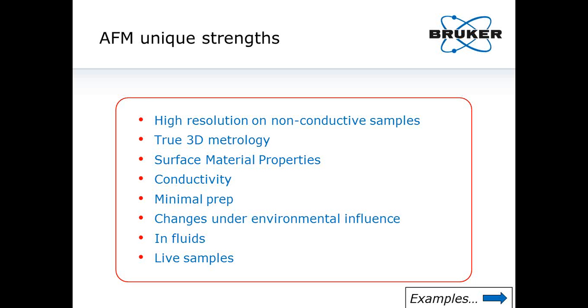After having convinced ourselves that the most current AFMs have evolved to be quite comparable to, for example, current SEM with regard to imaging speeds, usability and richness of information, we will now take a look at how the information provided by AFM is unique and complementary to other techniques. The AFM provides high resolution on non-conductive samples, with true 3D metrology and additional nanoscale material and, if desired, electrical properties. The required prep is often minimal, as the AFM typically looks at native sample surfaces, often in their native chemical environment. Responses to changes of this environment can be directly observed. Imaging in fluid also enables imaging biological systems up to live cells.